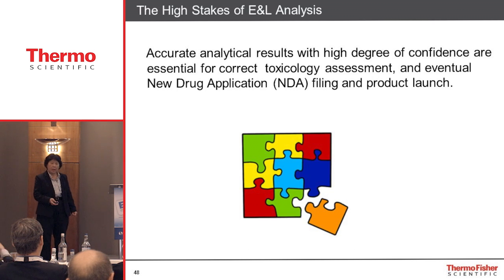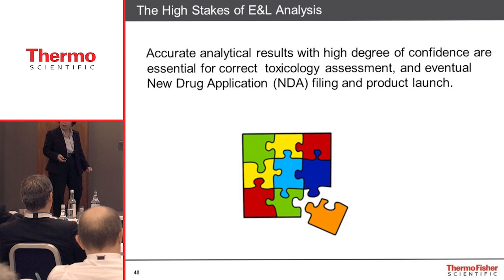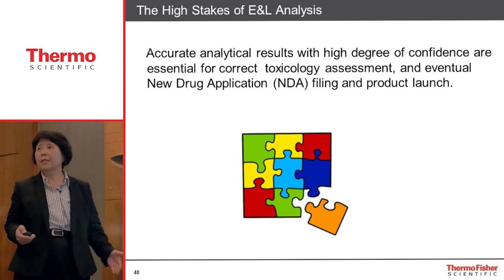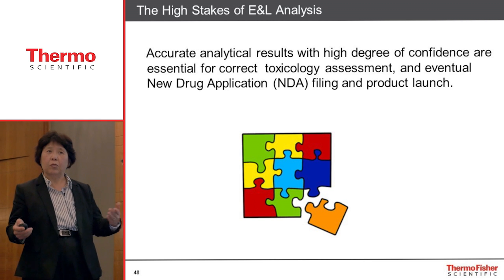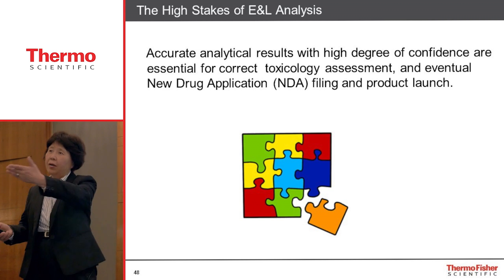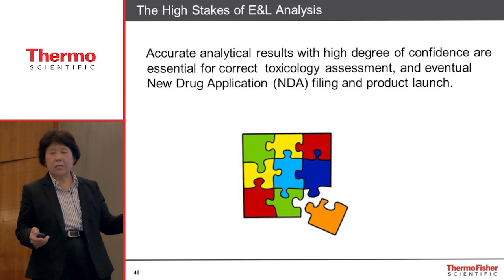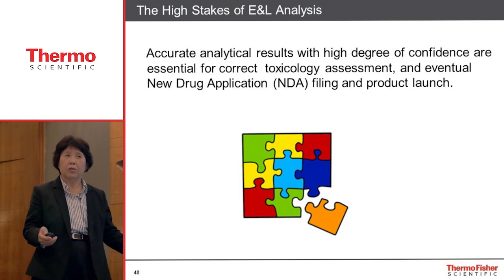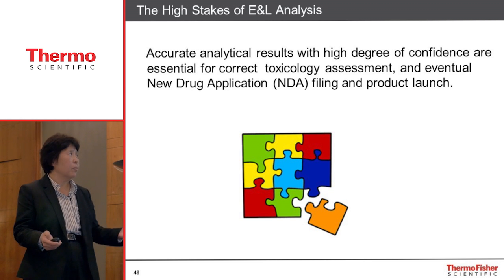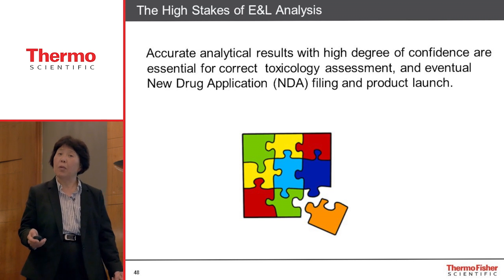Okay. I think what we are here to try to figure out is how do we do the extractables and leachables analysis better. I have to say, from my own experience, E&L analysis has become mainstream and routine. We get a lot of requests from customers. I've been asking all the experts here because we are an instrument company, for all those tox studies, how to do the evaluation. It's out of my knowledge, but our customers keep asking us. So I can feel that there are more and more E&L projects coming up.